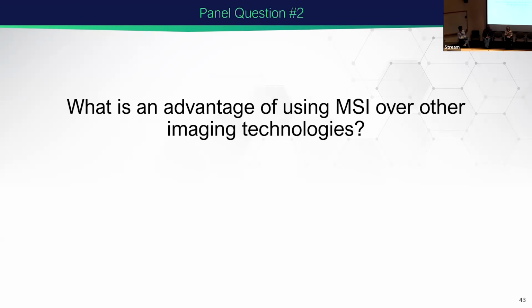Yeah, and also I didn't follow instructions completely, I think, but discussing what types of systems I look at. So my favorite thing to look at right now is really complex microbial communities that are made up of fungi and different bacteria, really working together in symbiosis to perform tasks that the Department of Energy cares about. Lignocellulose degradation: who's secreting the enzymes, what's the bacteria doing, and how they're all working together. And so what was the question? Oh, how is it better than other techniques?